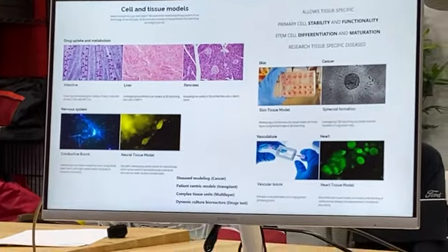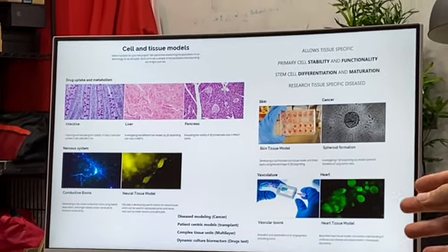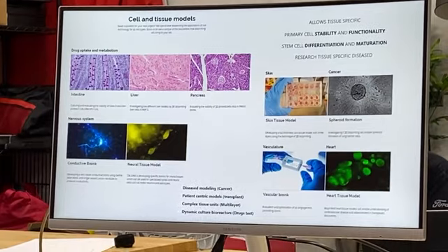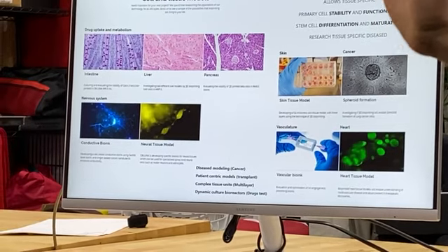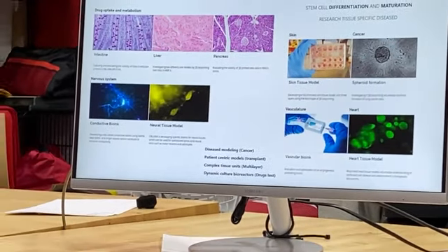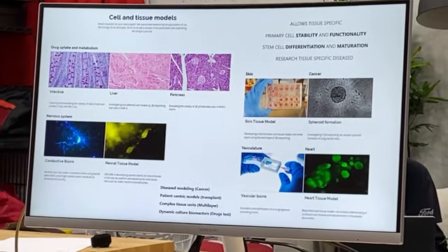And with those kinds of biomaterials, you can replicate tissues like intestine, liver, pancreas. With conductive ink, bioinks, you can create neural tissue models. All of these examples are for research purposes. It doesn't mean that you can implant that into the body, because you have to follow a long process. Like when you create a drug, you have to test it with preclinical testing and with animals, and do all this protocol very well, just to be pretty sure that it is safe for people, right?